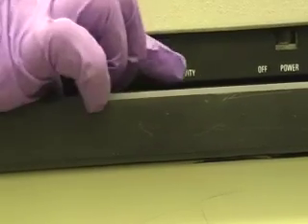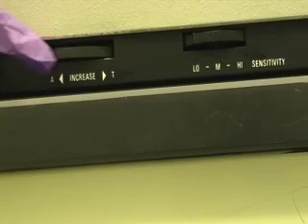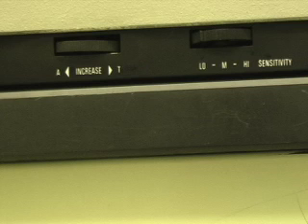Set the blank cuvette reading as 100% transmittance, zero absorbance, or zero concentration with the 100% T/0A control. The control is to the left of the sensitivity switch.